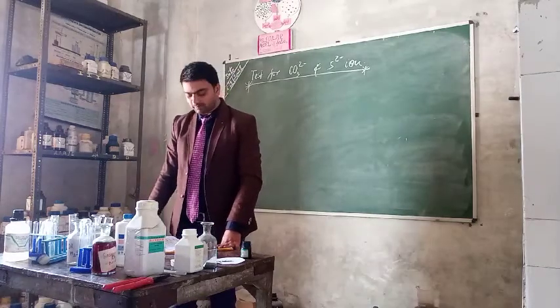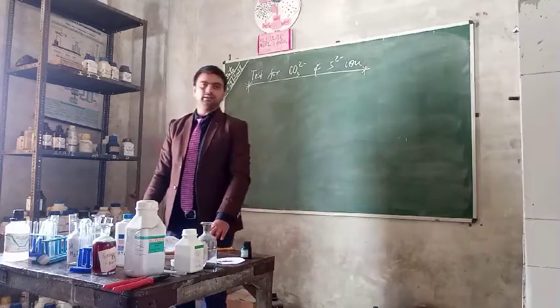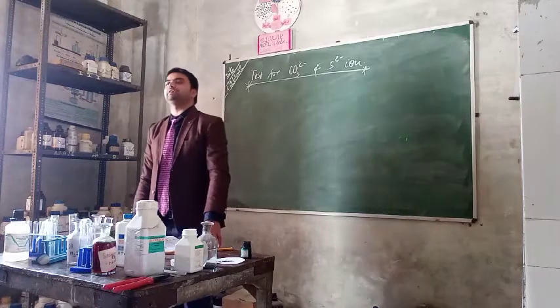Today we demonstrate the test of the carbonate and the sulphide ion. That means how to test the presence of the carbonate ion in the given salt.